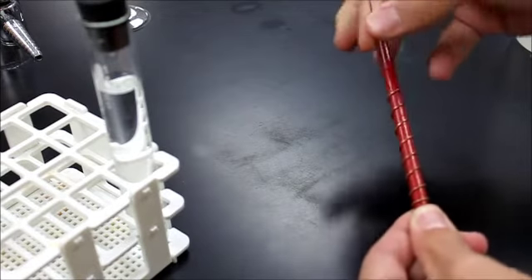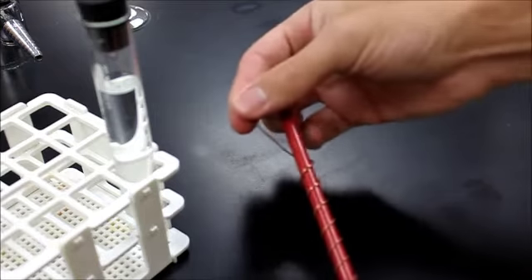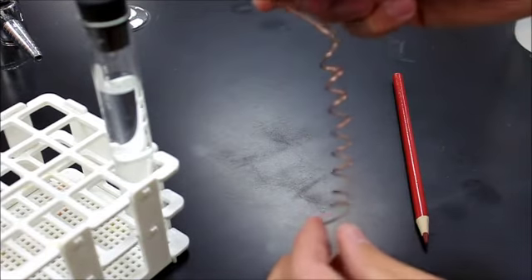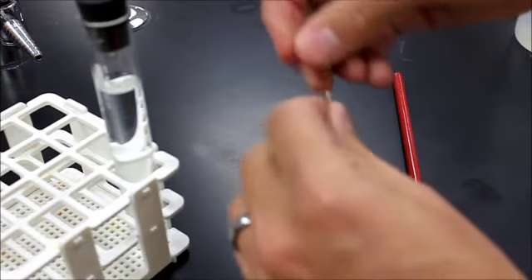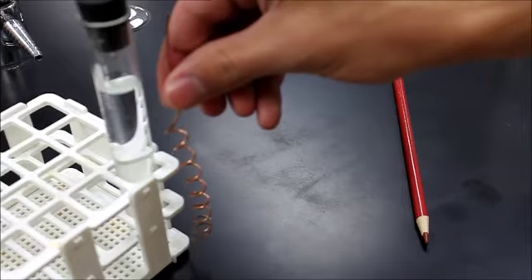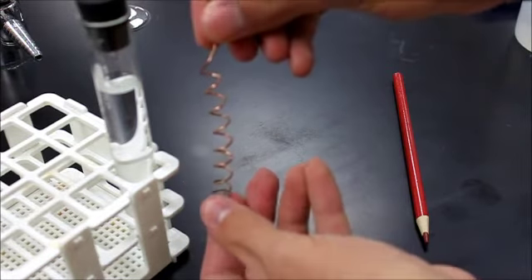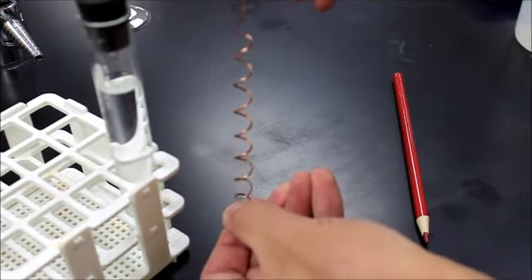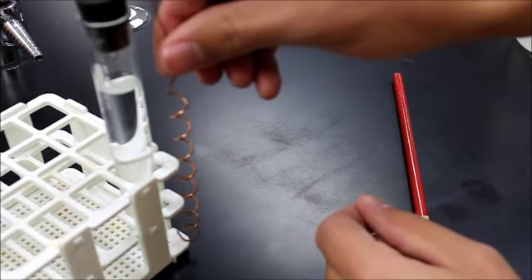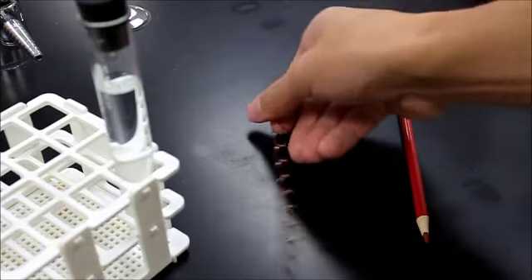And then you're going to leave a little top poking out. So now you can just take this and bring it off, so we have this coil of wire. And when you make the coil, you don't want the whole thing to go into my test tube. Right here, the whole thing would go down into the test tube and I wouldn't be able to get the top out. So now you stretch it just a little bit such that the top of your copper wire is going to be sticking out of your test tube.